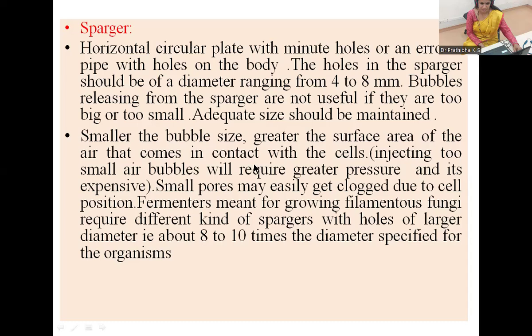What about the holes? If that is too small, cells will go and sit there and it will be clogged. It's very complicated if that is too small. And too big is also very complicated. Too big also not manageable. So that should be adequate.